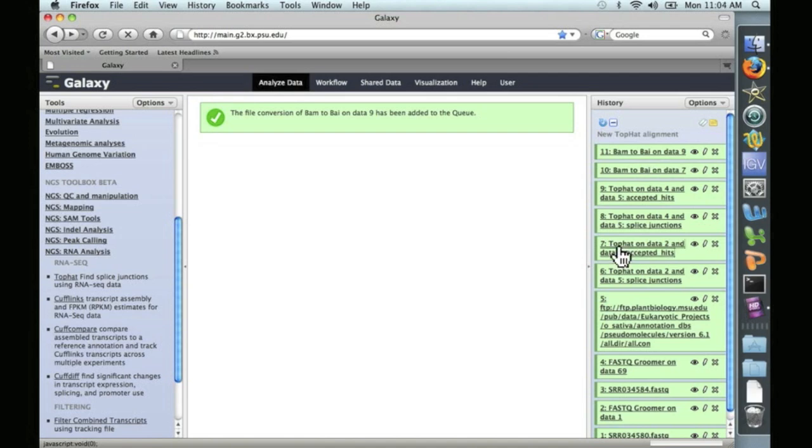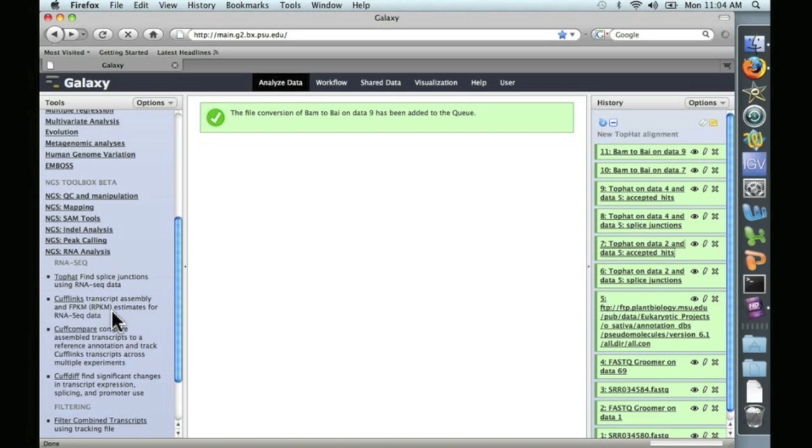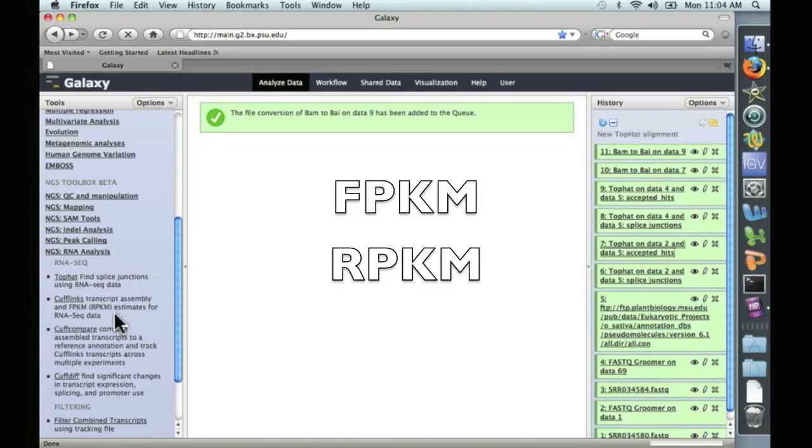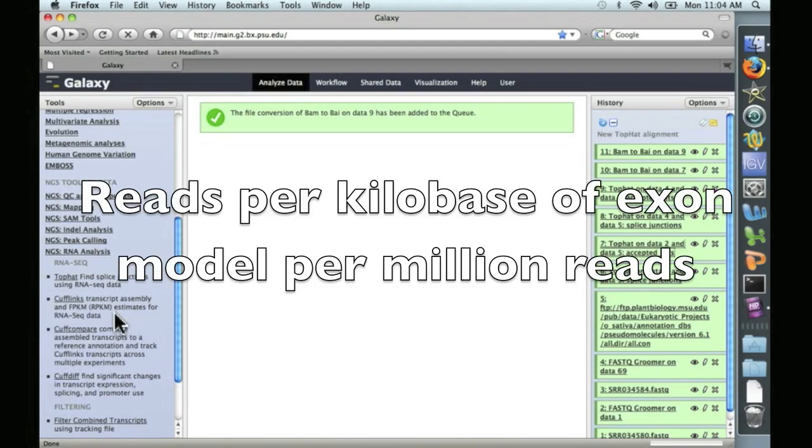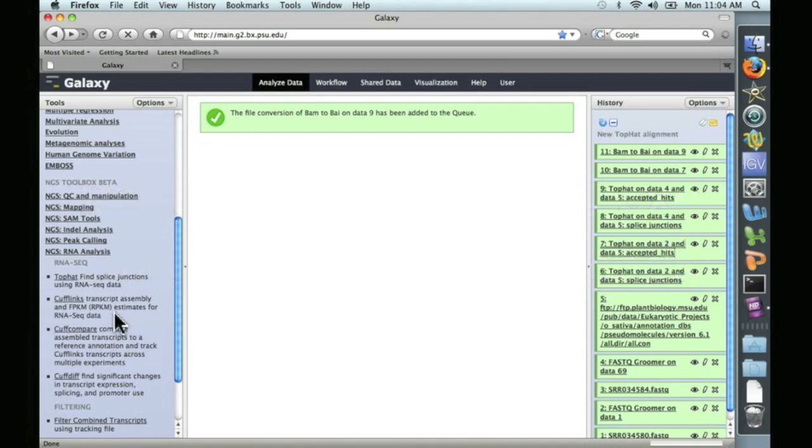Right now, we're going to proceed to Cufflinks. Cufflinks is found over here in the same RNA analysis menu. And what Cufflinks will do is it will take all of the reads and the alignment generated by TopHat and attempt to assemble transcripts. It will also estimate transcript abundance using something called FPKM or RPKM. And RPKM stands for reads per kilobase of exon model per million reads, so it takes into account transcript size and read abundance.